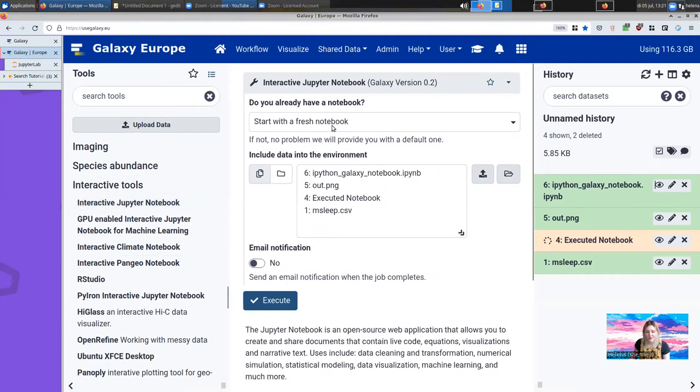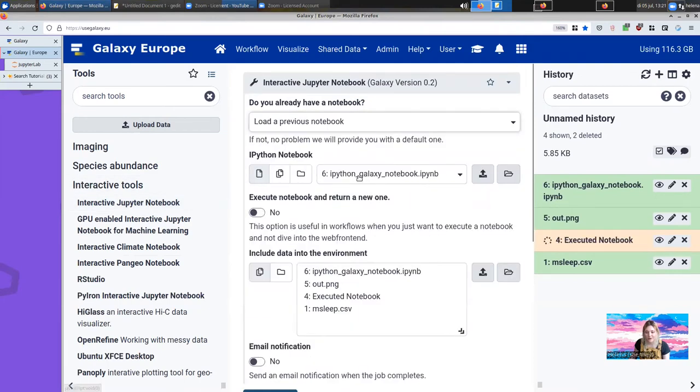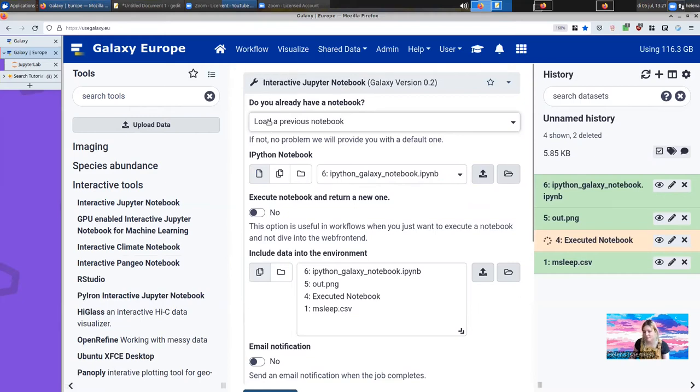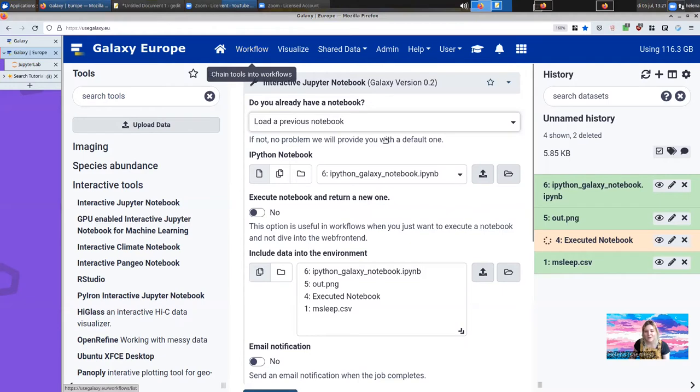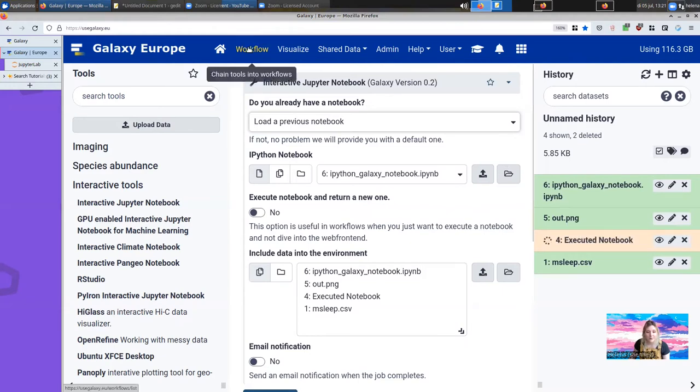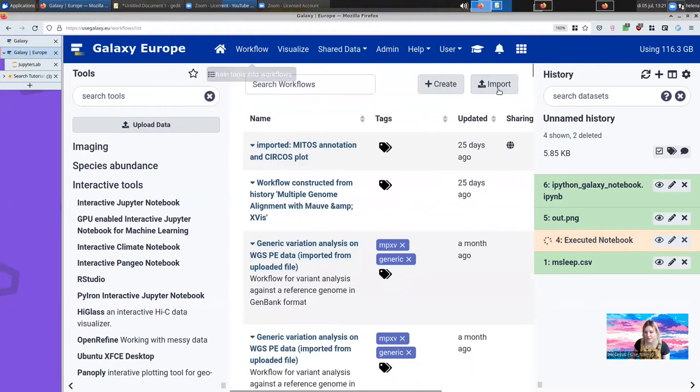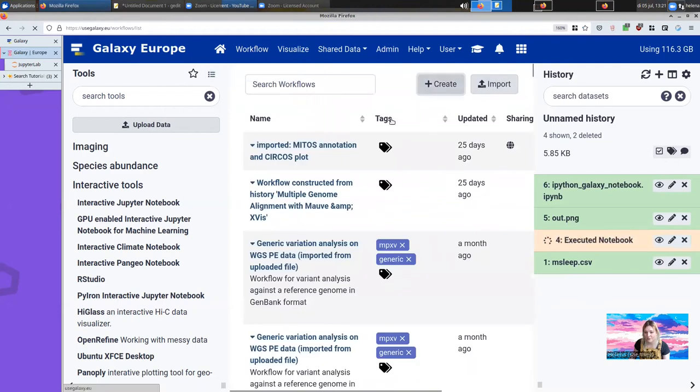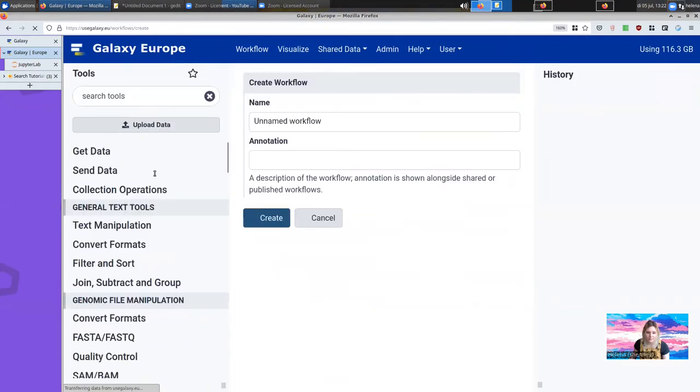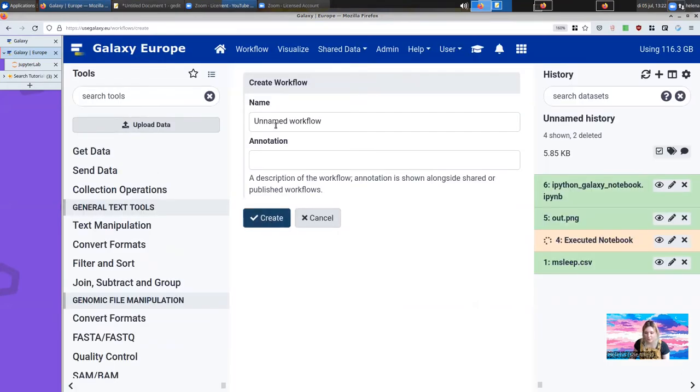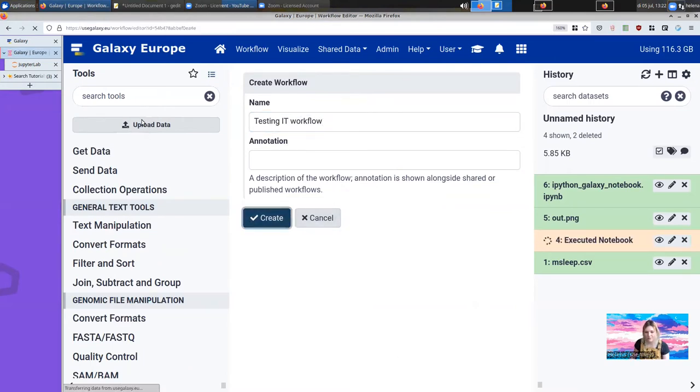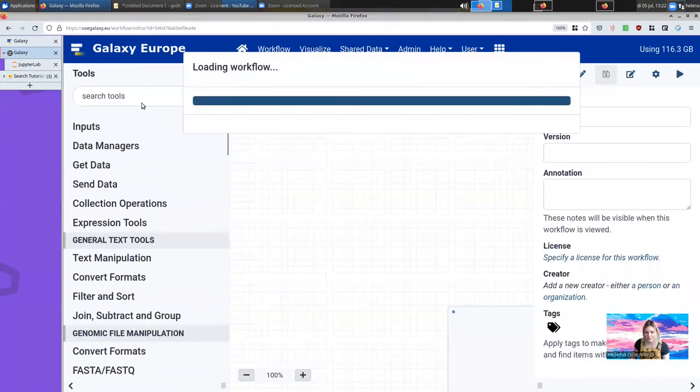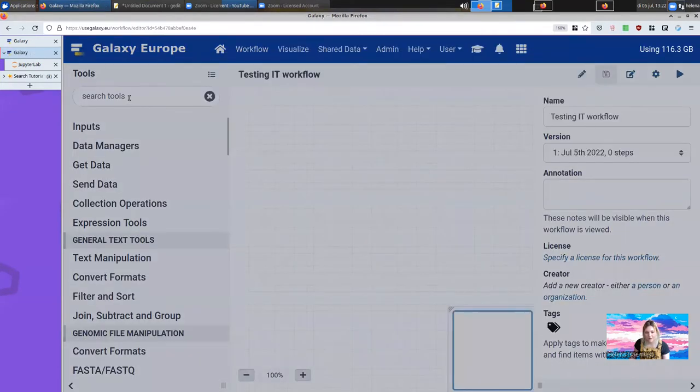Here we can select Load Previous Notebook instead, and it will load in all of the code that we were running before. One of the amazing new things about interactive tools, as opposed to the older version, one of the things that makes them so much better for researchers, is that you can use interactive tools inside a workflow as well. If you have a workflow, here we'll create a simple workflow from what we're doing right now. I'm going to call this Testing IT Workflow.